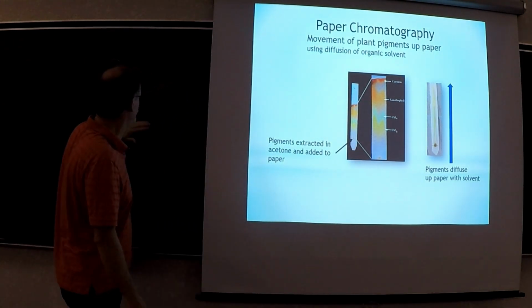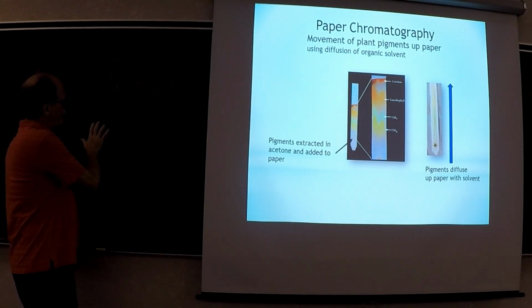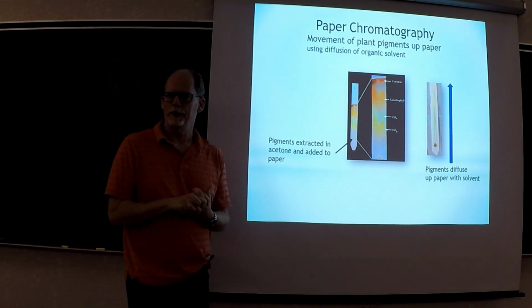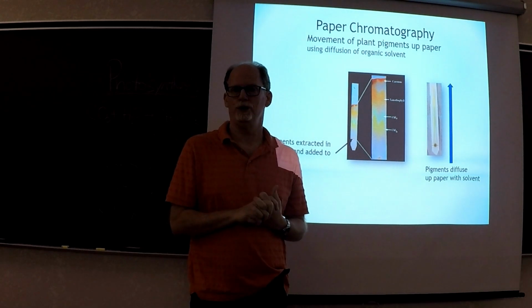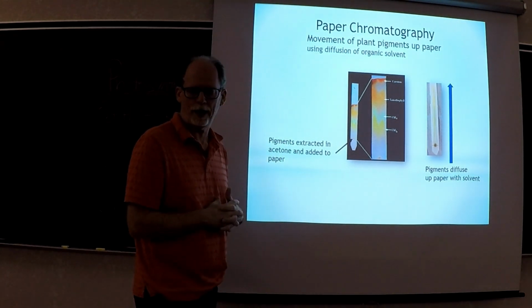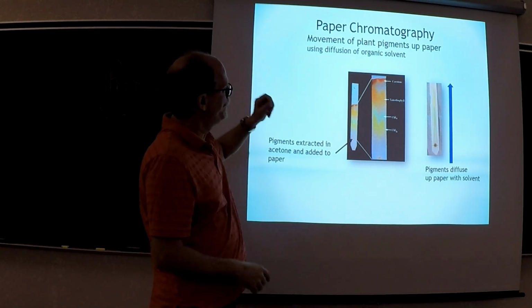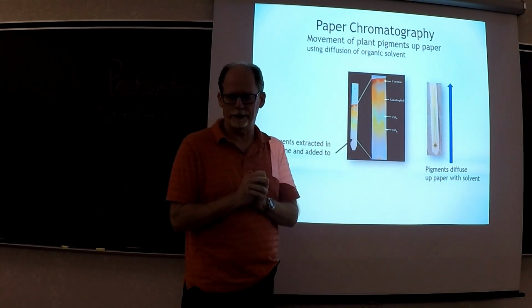That's how photosynthesis occurs. You need an input of energy to take CO2 and turn it into carbohydrates. And we're going to get into all the details of that in class when we do chapter 10. So I'll explain that process. The purpose of this experiment is to separate the pigments, right? They're all together inside the leaf.